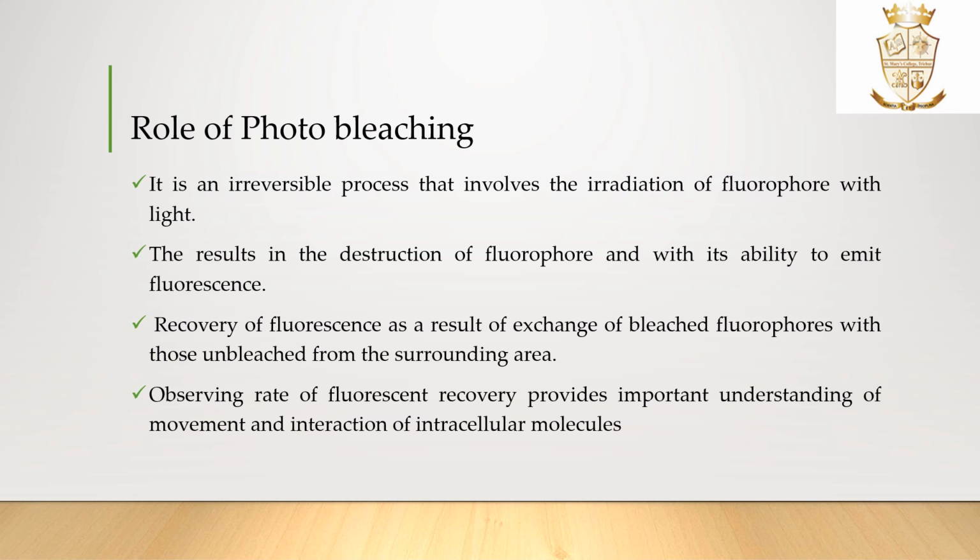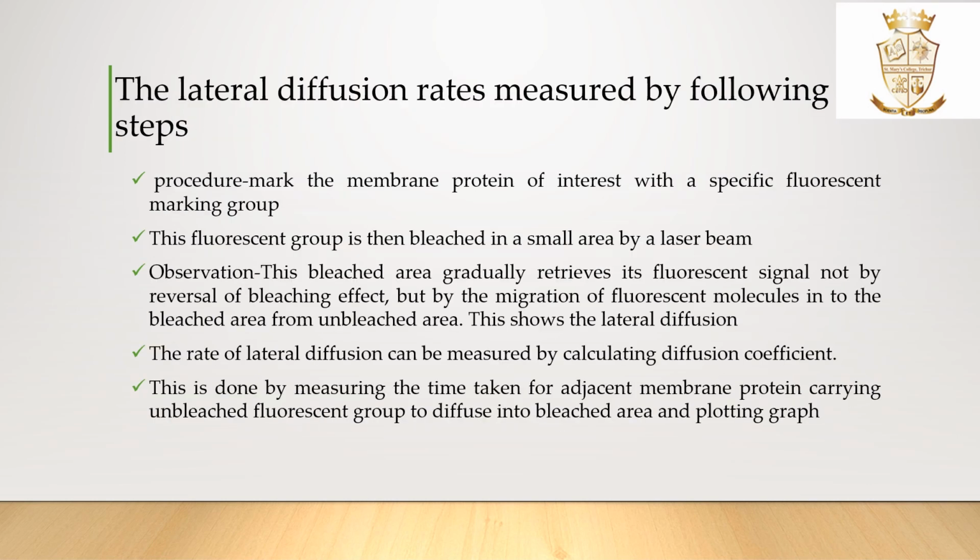Recovery of fluorescence as a result of exchange of bleached fluorophores with unbleached ones from the surrounding area is shown in the FRAP technique. Observing this rate of recovery provides important understanding of the movement and interaction of intracellular molecules. This movement shows the diffusion of molecules in the plasma membrane.